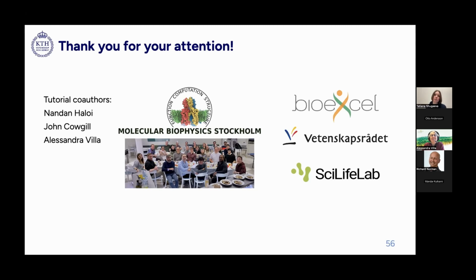That's a good question. I am not super familiar with ISOLDE, I didn't use it that much. But I think density guided simulation might be more useful in the more complicated cases because you have a lot of parameters to fine tune, and you can try to simulate maybe more significant conformational transitions compared to ISOLDE.